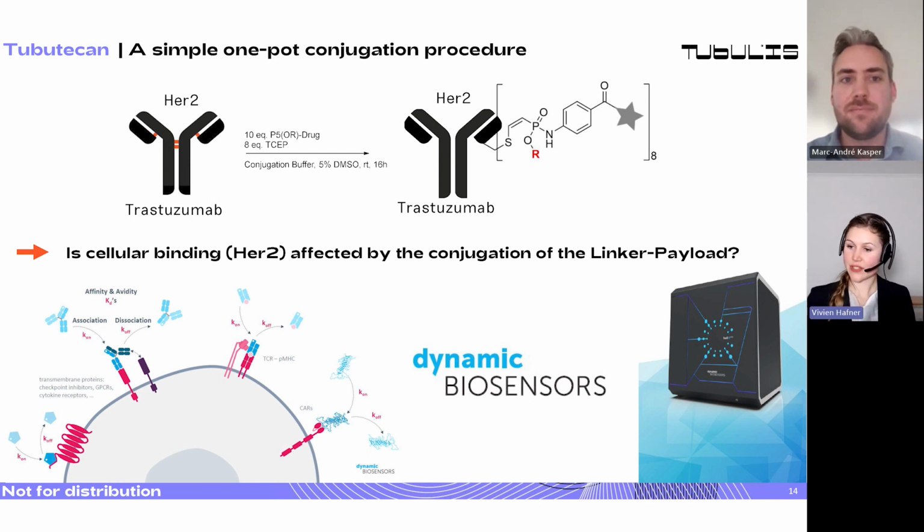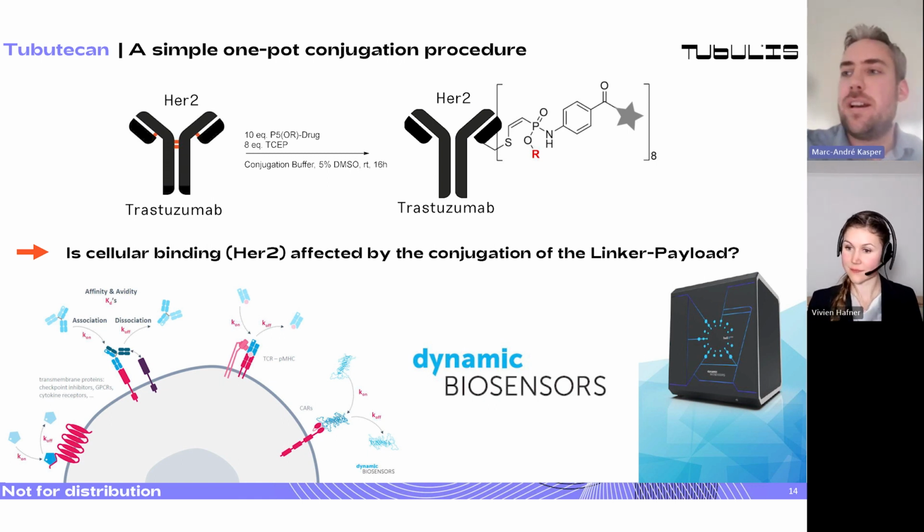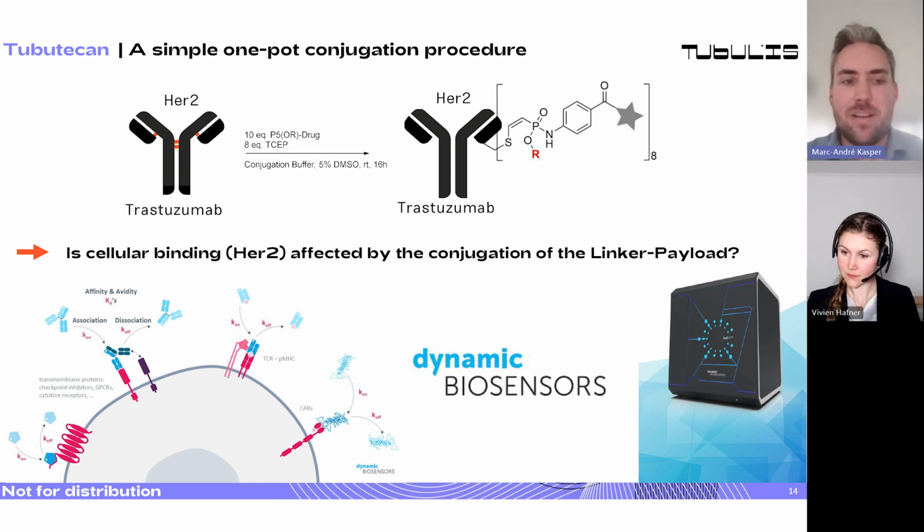Then there's another question about the linkers, whether you have used enzyme-activated linkers in the ADCs, or if you have any suggestions in choosing this type of linkers. Yes, we do. With enzyme activation, I think you're referring to a cleavable linker, which releases the payload after the ADC is taken up into the cell. And yes, we do, and we think it's crucial for a couple of reasons.